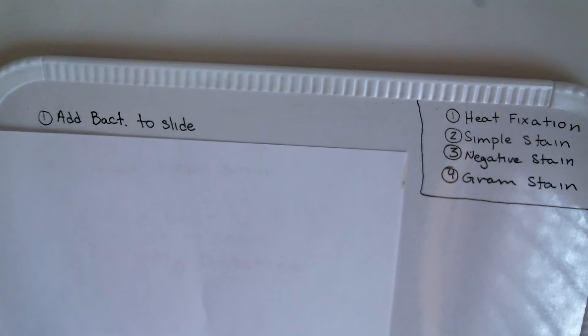The way that we would do that is we would first add the bacteria to the slide. So if it's in a test tube, we'll just take it right out of the broth and take anywhere from one to three loopfuls and let that dry. Typically, if you know that your bacteria is gram-negative, you'll use more loopfuls just because gram-negative cells are much smaller than gram-positive cells.